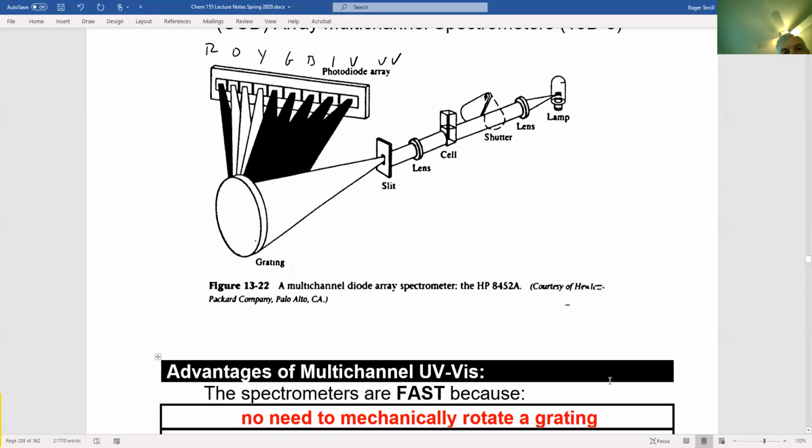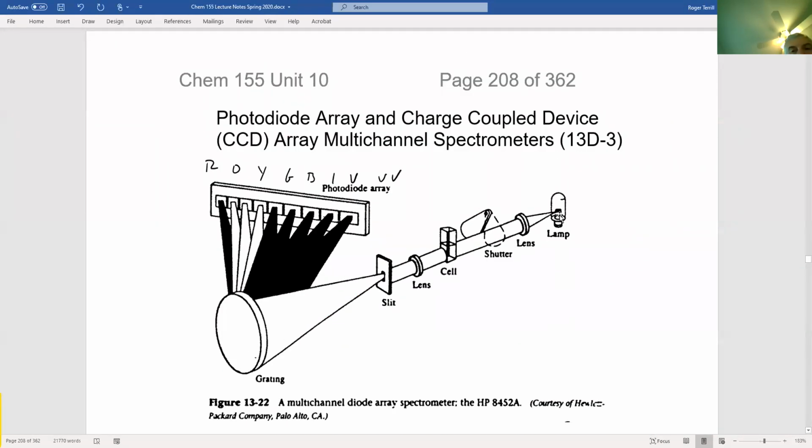let's just say, for example, that you're illuminating all across from, say, 200 to 800 nanometers, right? But your specimen absorbs strongly at 200 and it starts to decompose. Photodecomposition is actually a real thing. And so what you could find is that over time, the absorbance spectrum decays. Whereas if you just put red, orange, yellow, green, blue, indigo, violet, ultraviolet in there sequentially, you got much less sunburn. But it just happens a little bit more slowly, right?